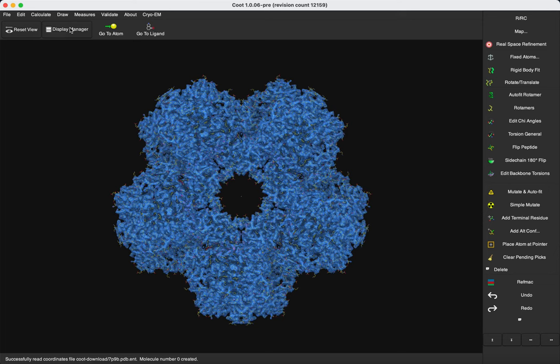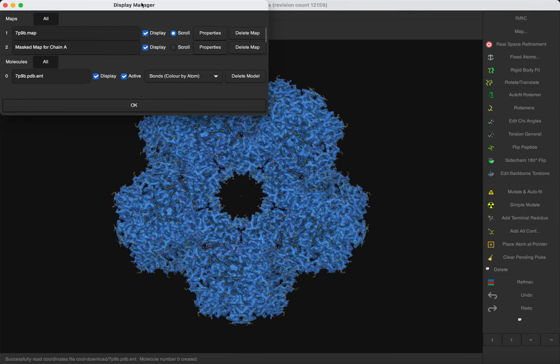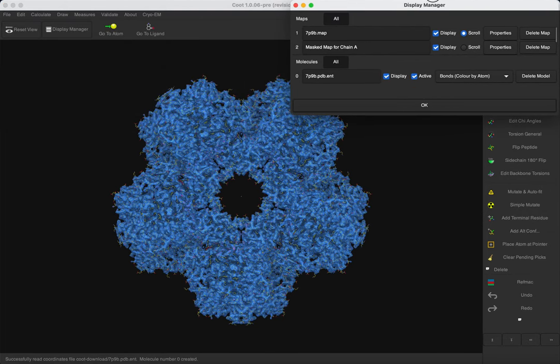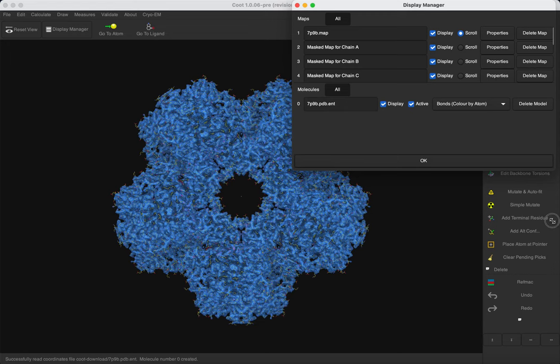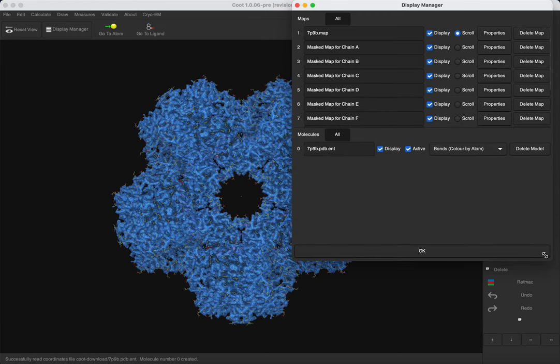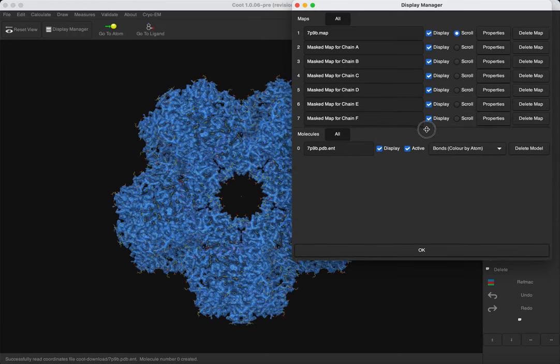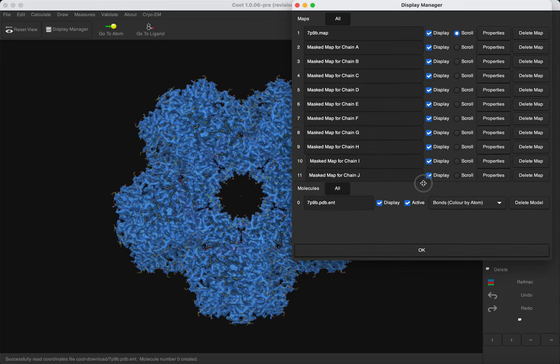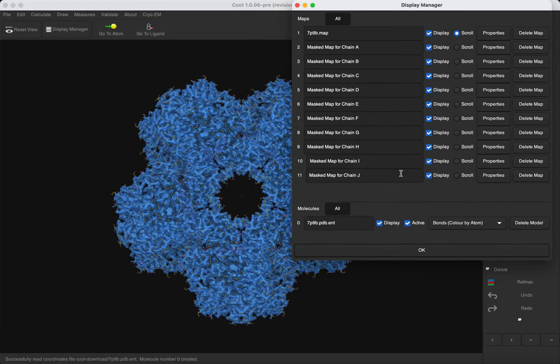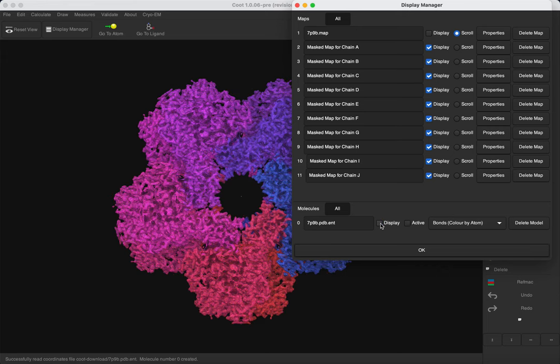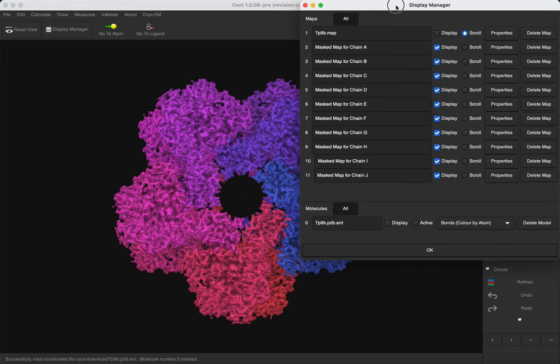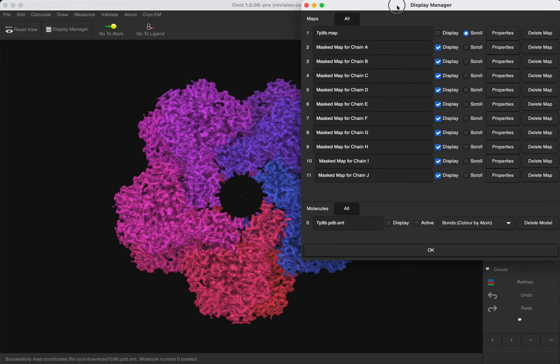Let's open the display manager, and we can see that now we have a masked map for all the chain. If we undisplay the original map, you can see that each map is already colored in a different way.